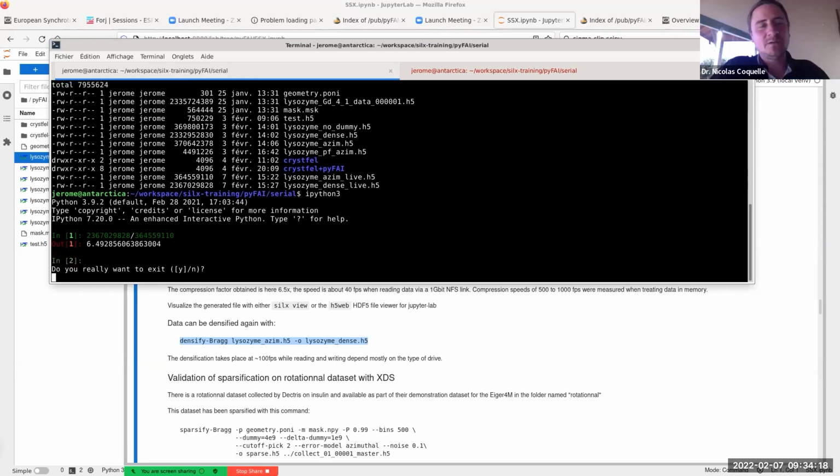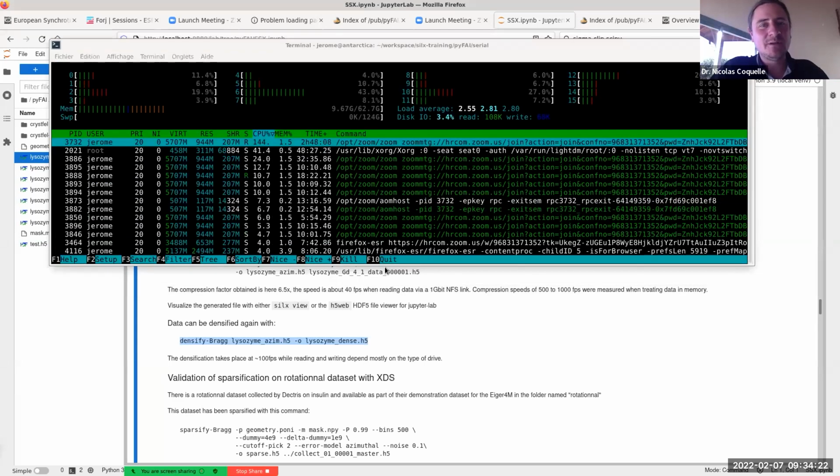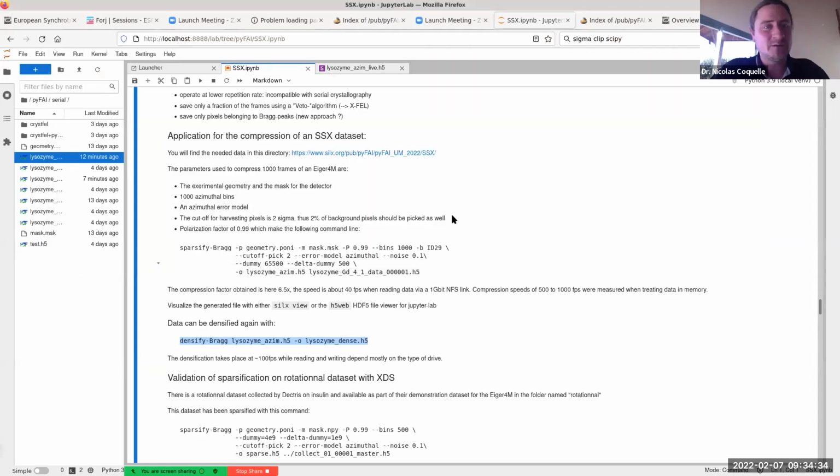But still, 100 micron on one panel will mess up the position of the expected Bragg spot compared with the measured Bragg spot. So even for us, it's going to matter at some point, Jérôme, I think. That's something we will have to do. XDS has the nice ability of retrieving the distortion map, which is why we want to use XDS.